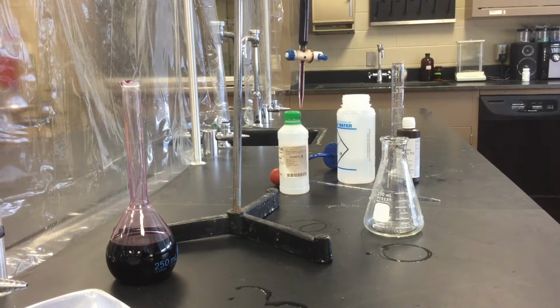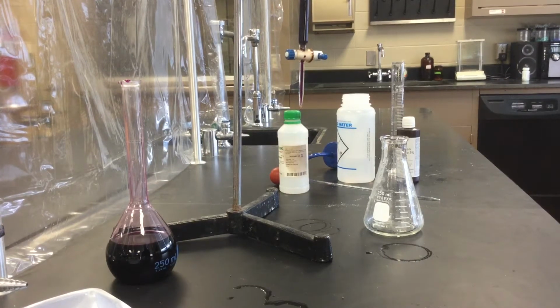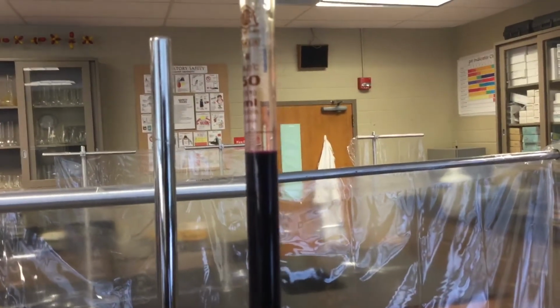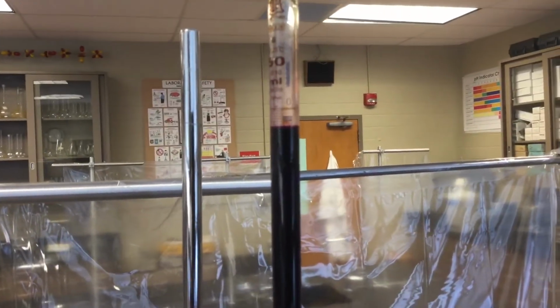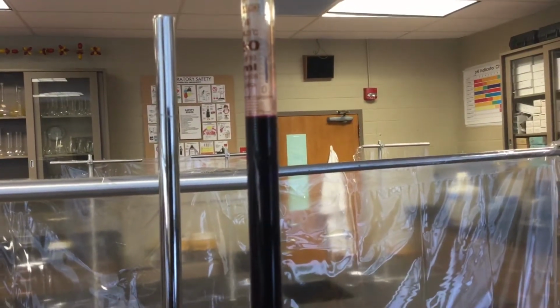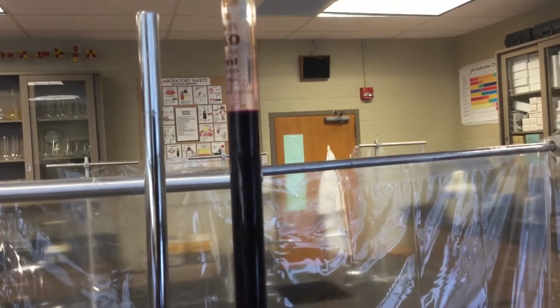So hopefully you've used the data from the introductory activity to figure out the exact concentration of the potassium permanganate in the solution. So for the guided inquiry activity, we're going to use that to determine the concentration of the hydrogen peroxide. I have refilled the burette. So just to make sure we have enough to do the titration, looks like we're at 7 milliliters. I'm sorry, yeah, 0.7. We're starting at 0.7 milliliters on the burette.